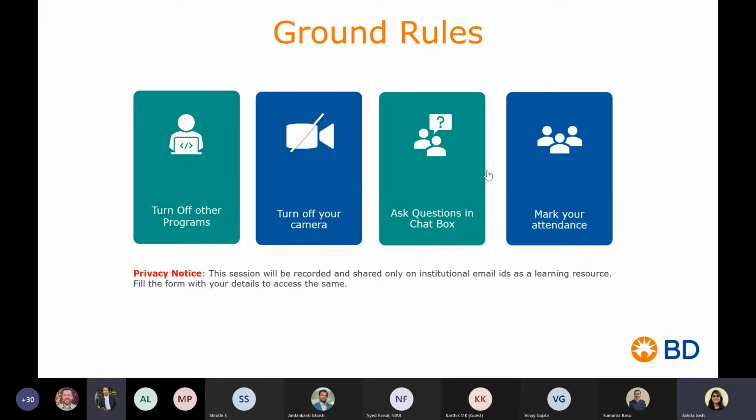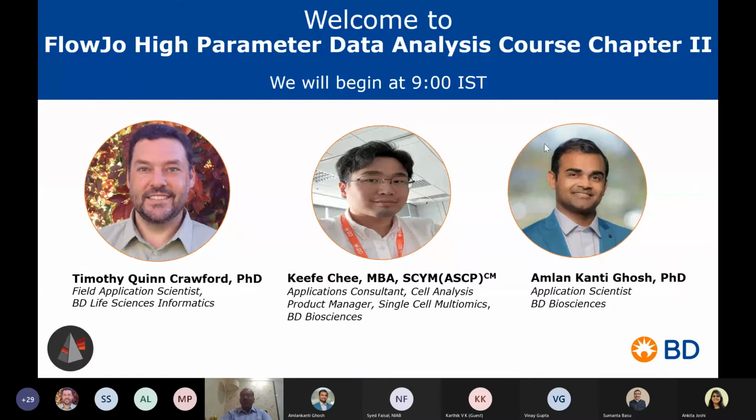Thank you, Ankita. I think we are now into the second chapter of the FlowJo session. Today we have those participants who are going to the next level. So this is chapter 2 of the high parameter data analysis course, where we are going to get into more details of the FlowJo software. I'm sure in the first chapter we got an overview. Tim took us through very detailed parts of the FlowJo software, where he showed us all the sequence of using the software. Also, he touched upon the compensation modules.